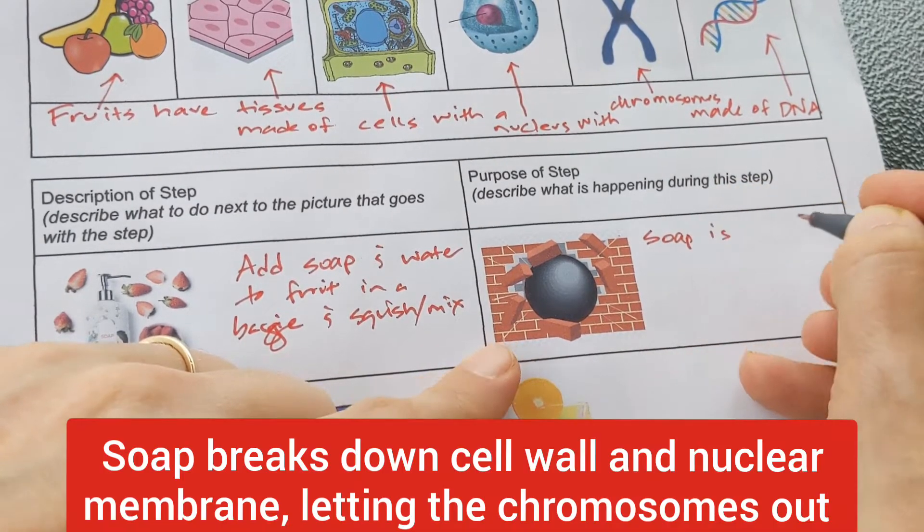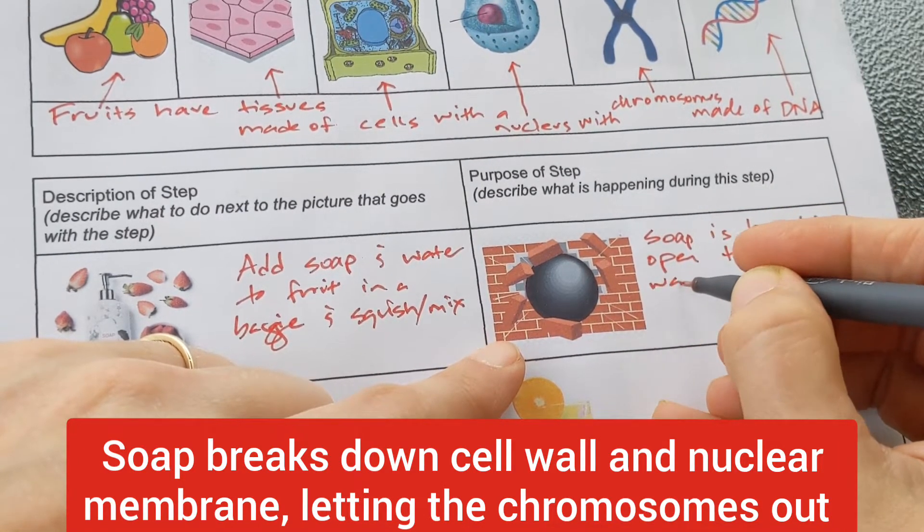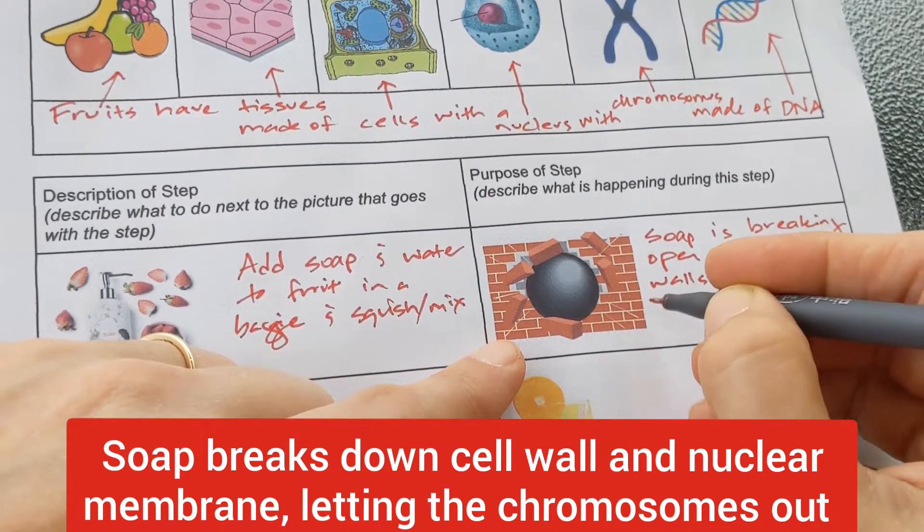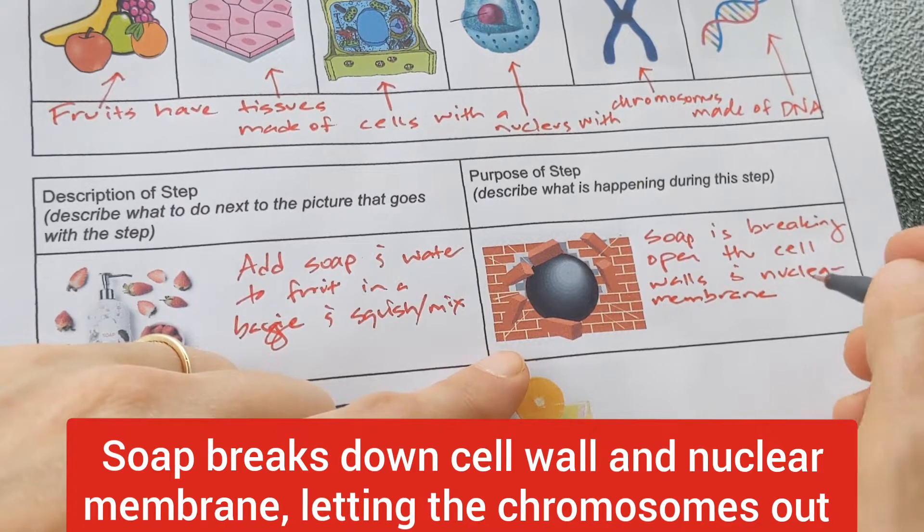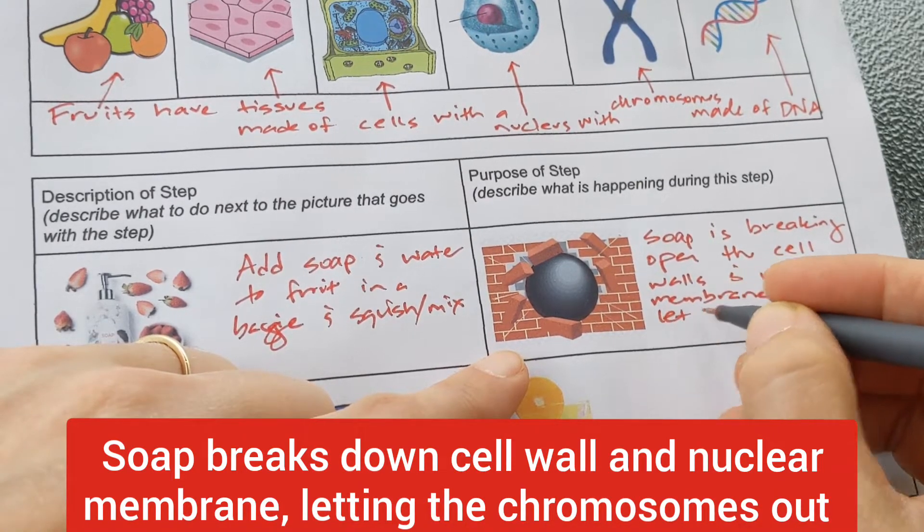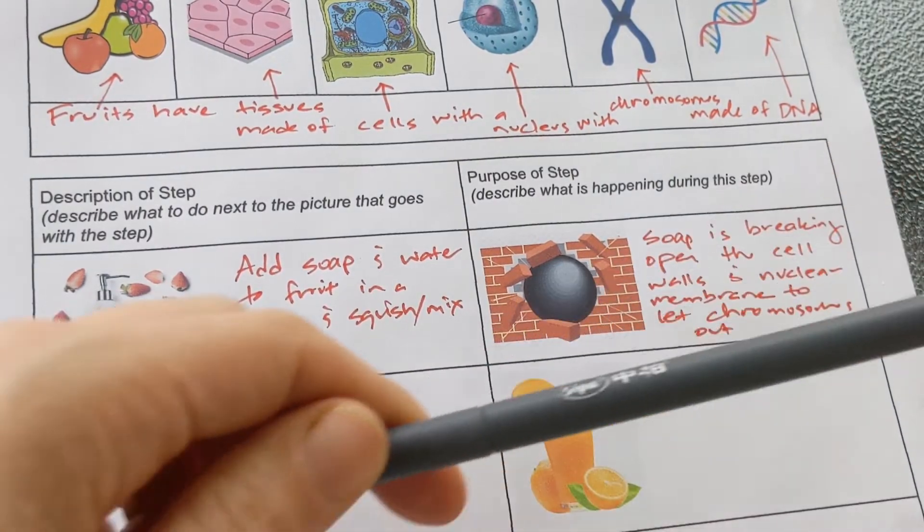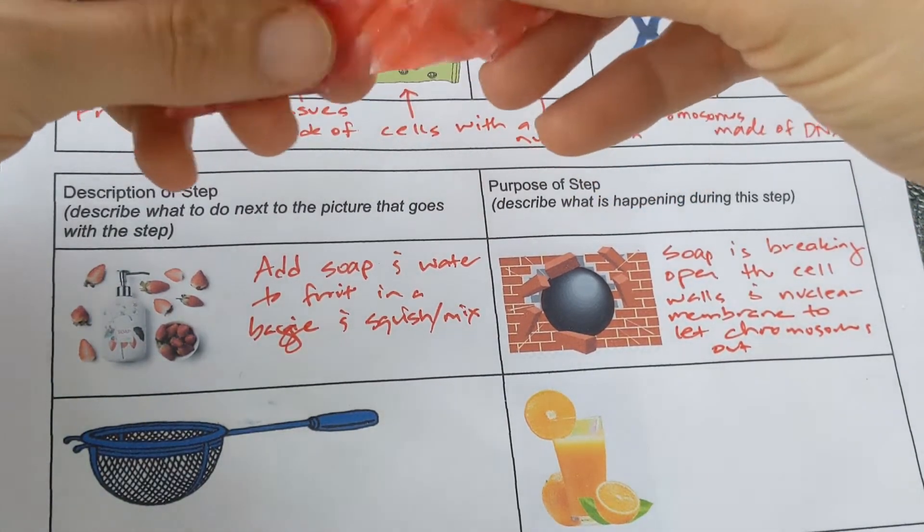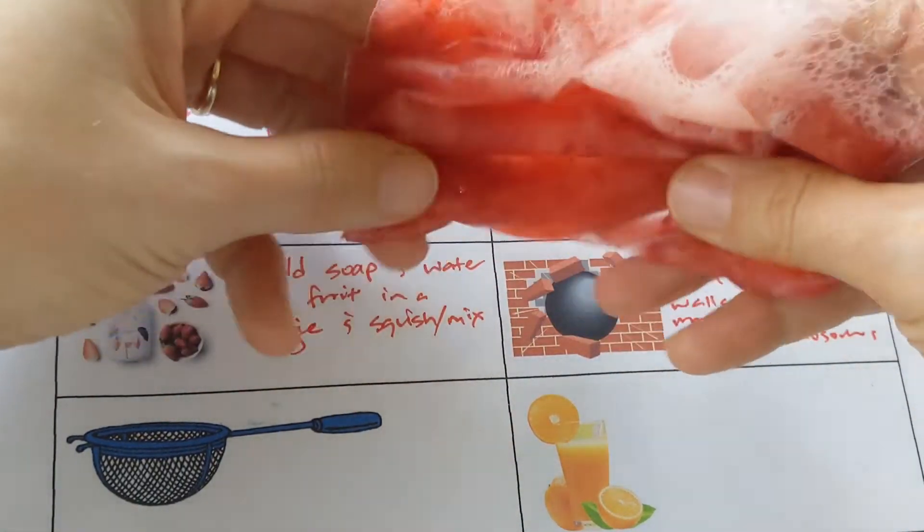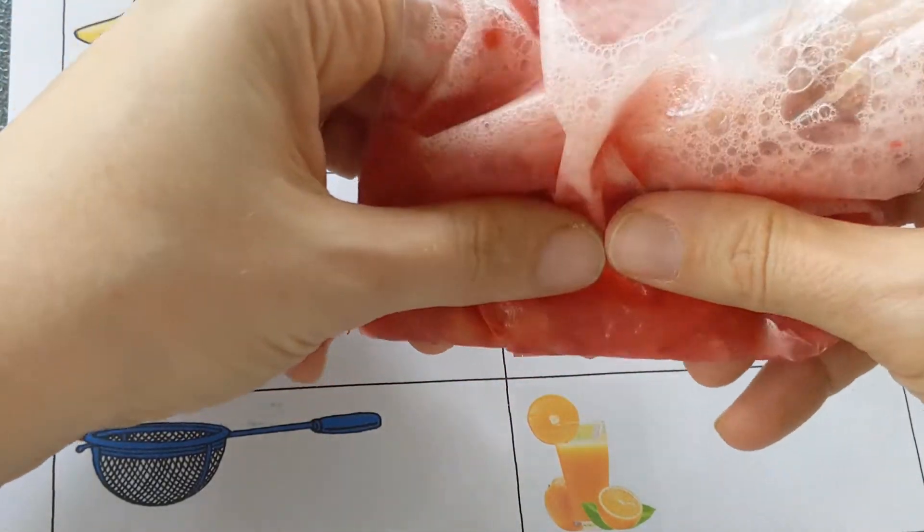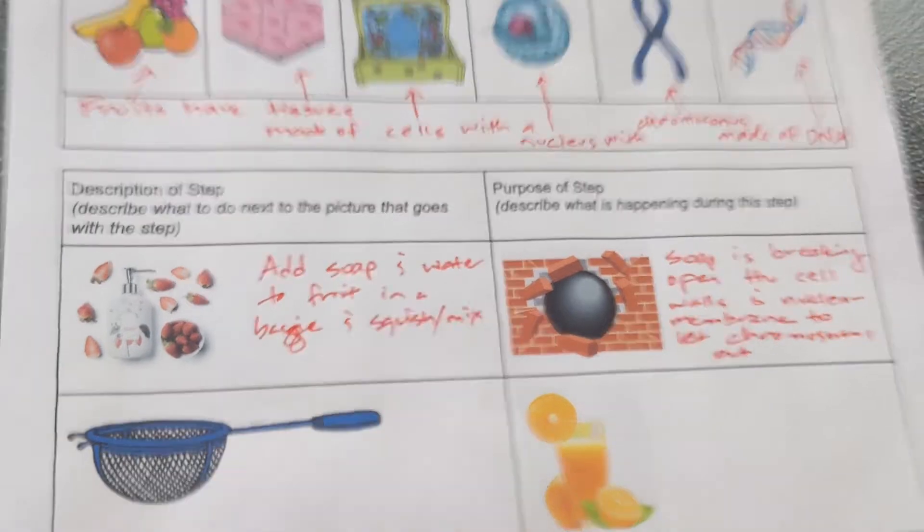The soap is breaking open the cell walls, but it's also breaking open the nuclear membrane. And the nuclear membrane is like the sac around the nucleus. The nucleus is kind of like a balloon. And if you pop the balloon, inside are the chromosomes. So we're going to let the chromosomes out. Those chromosomes are now free floating. The more you mix it, the better.